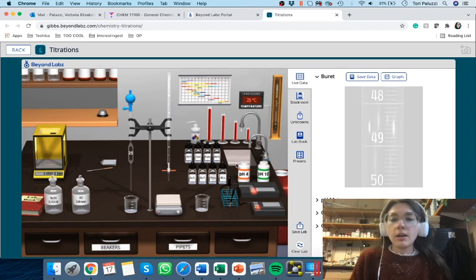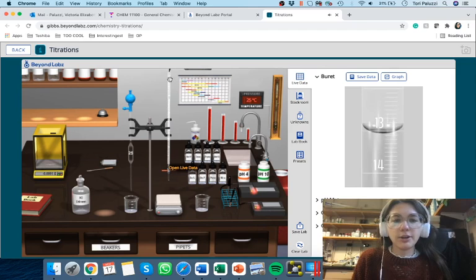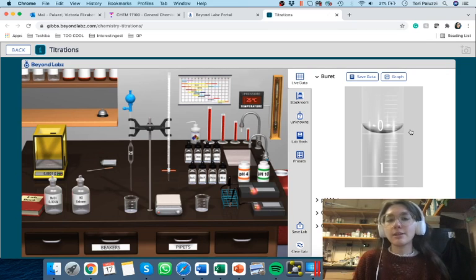The next thing we're going to do is I took the sodium hydroxide, I hover it, and I just fill my little burette up. It magically puts itself to 0.00. If you want to be fancy and put it at 0.01, that's up to you, but just know that burettes are always going to have up to 2 decimal places for the accuracy.